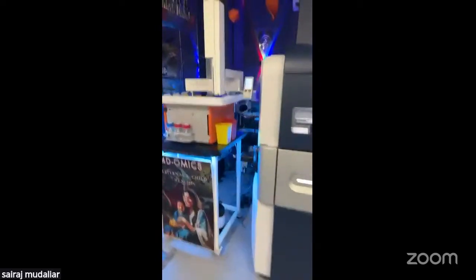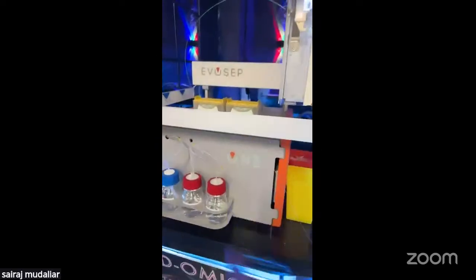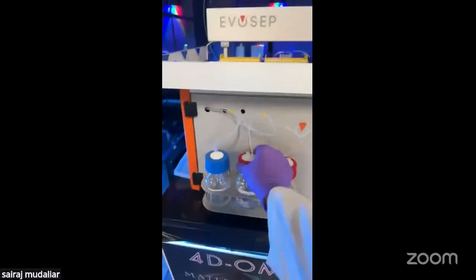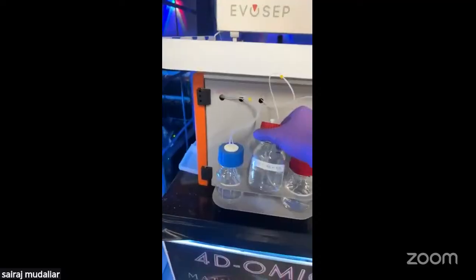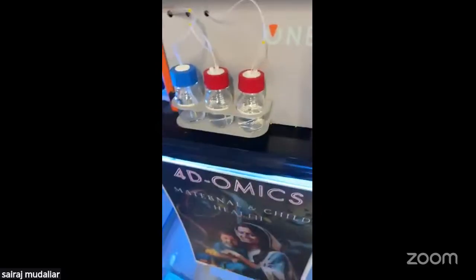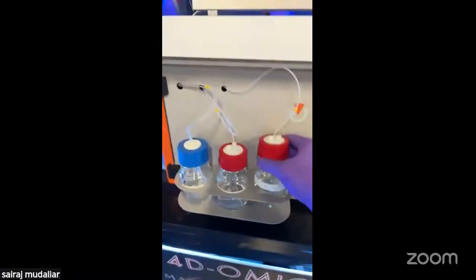Okay, thank you, sir. So this is the timsTOF Pro instrument, and it is integrated with the nano LC, which is from the Evosep One. Here you can see the mobile phases. In this system, for the hydrophilic mobile phase we use 0.1% FA in water, and for the hydrophobic we use 0.1% FA in ACN. This is how we make the mobile phase.